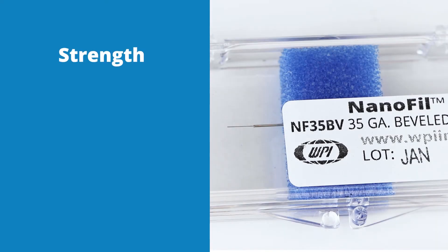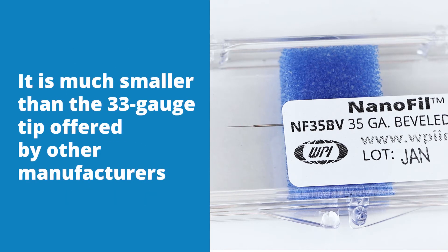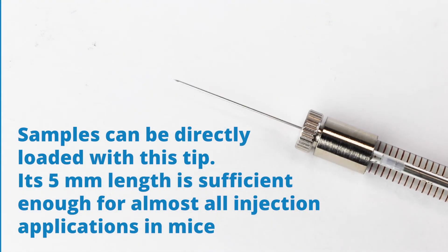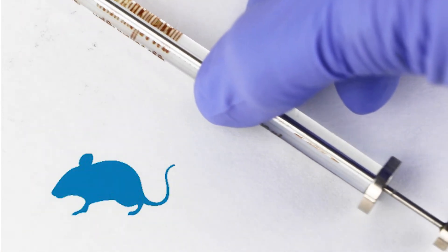The combination of its strength, length, durability, and clogging resistance creates a solid balance. It is much smaller than the 33 gauge tip offered by other manufacturers, and it is only slightly larger than our 36 gauge tip, but it is much stronger and less likely to clog. Samples can be directly loaded with this tip. Its 5 mm length is sufficient enough for almost all injection applications in mice.